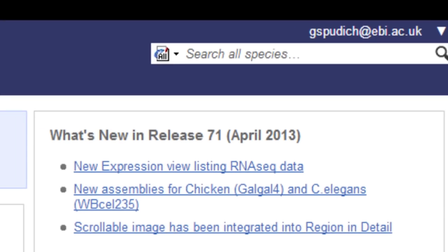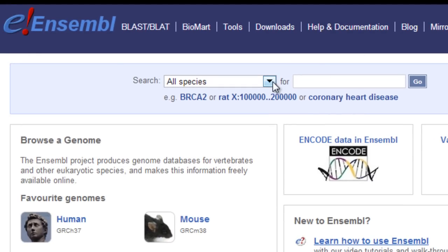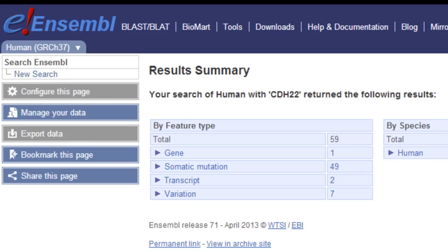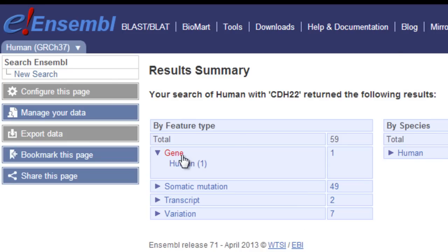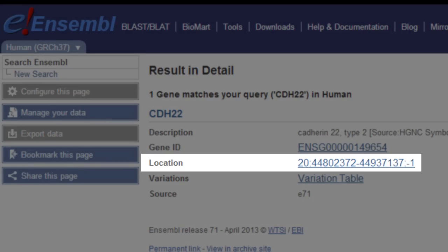From the home page, I'm going to change the species to human, type CDH22, and click go. I'll expand gene and click on human. Then I'll click directly on the location on chromosome 20 to go to Region in Detail.